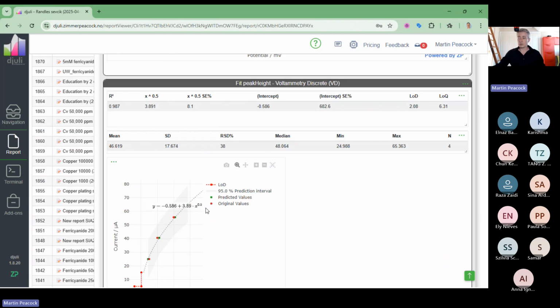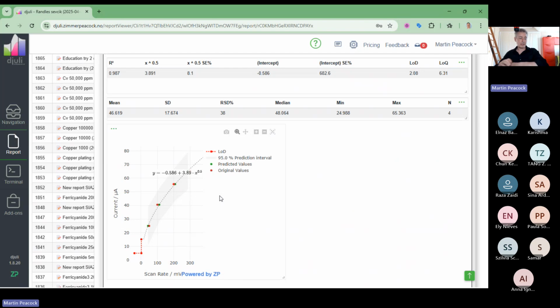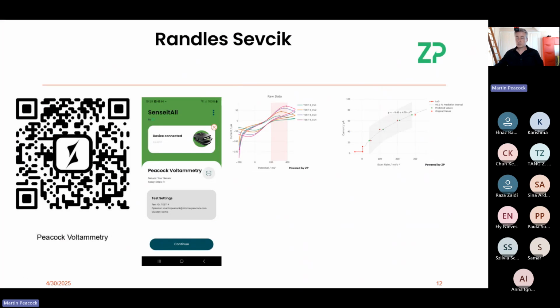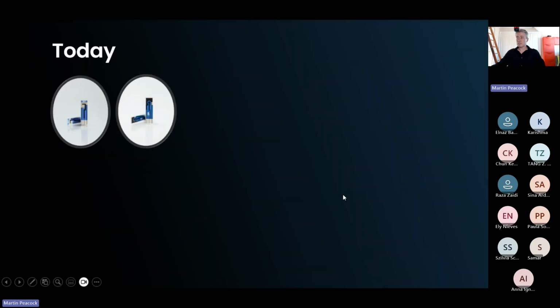So that's also showing you that people like to do this experiment. The reason they like to do it is because it's actually quite straightforward. And I think I've just demonstrated how quickly you can do it. So we think that's quite a nice experiment for the teaching lab because it was quite easy to do. So what I want to do now is probably finish off.